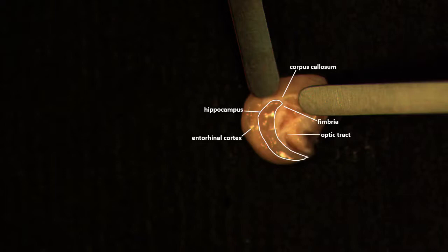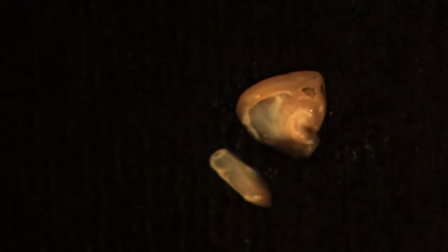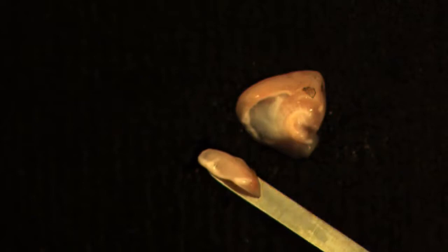Using one spatula to hold the cerebral cortex down, place the tip of the other spatula under the ventral part of the hippocampus. Roll out the hippocampus and separate it from the cortex. Use caution so as not to damage the hippocampus. Inspect the tissue for pieces of contaminating cortex. The cortex appears to be a different colour from the hippocampus, so you can easily cut away any remaining pieces. Thereafter, repeat the same with the second half of the brain.